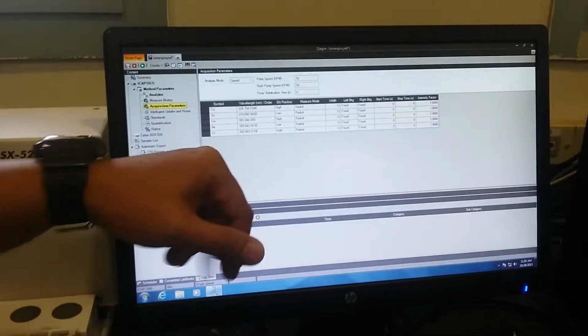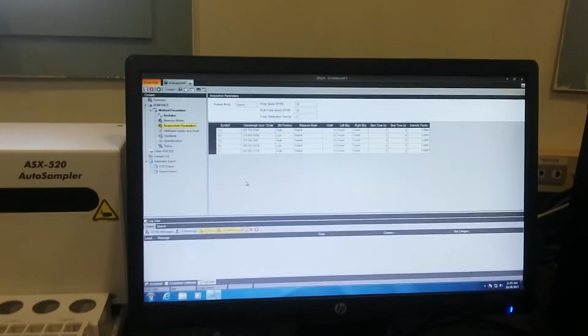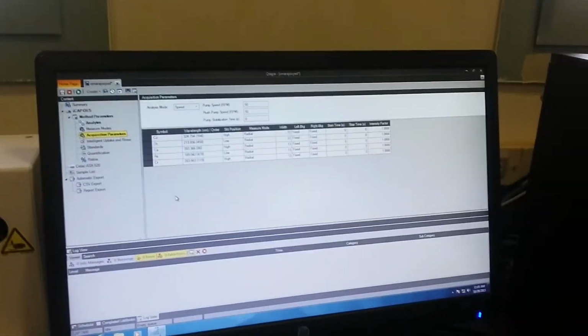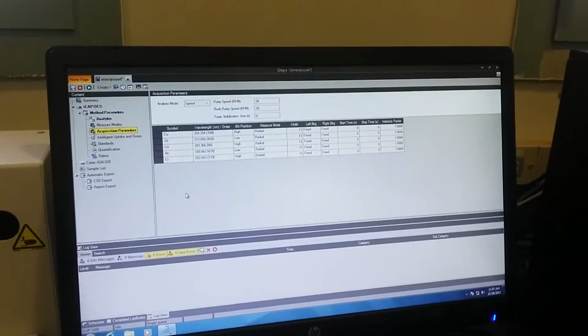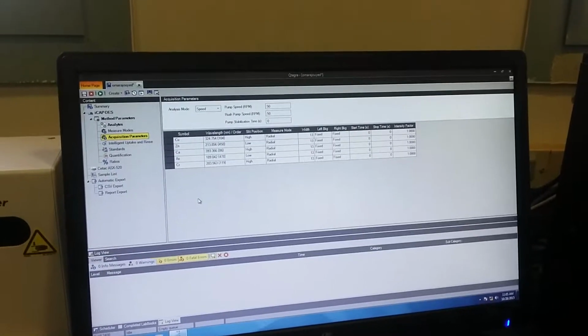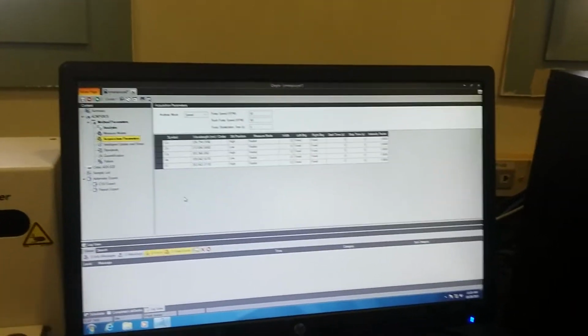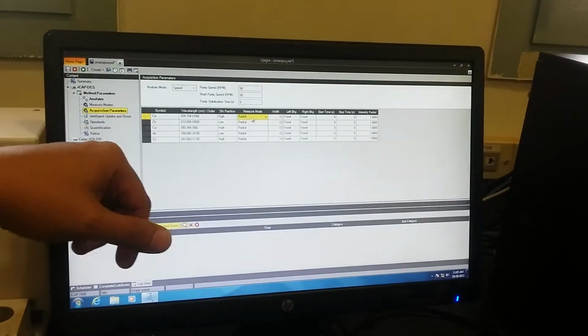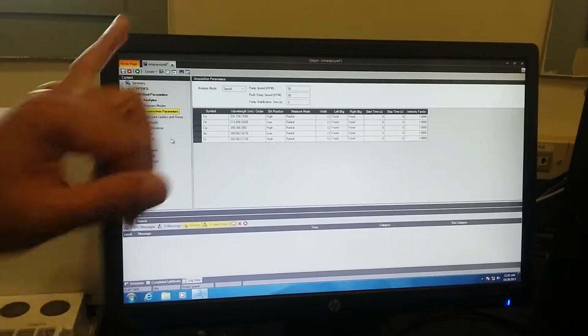So in this window, in the measure modes, we don't need to change anything. The software is designed to control a dual setup, but since this is configured as radial, there's nothing to change. Unless you have a specific method telling you to change the uptake time or the position. Right now, if you select all the default settings, it will give you the best settings. So far it's okay. Intelligent uptake, no need to click.